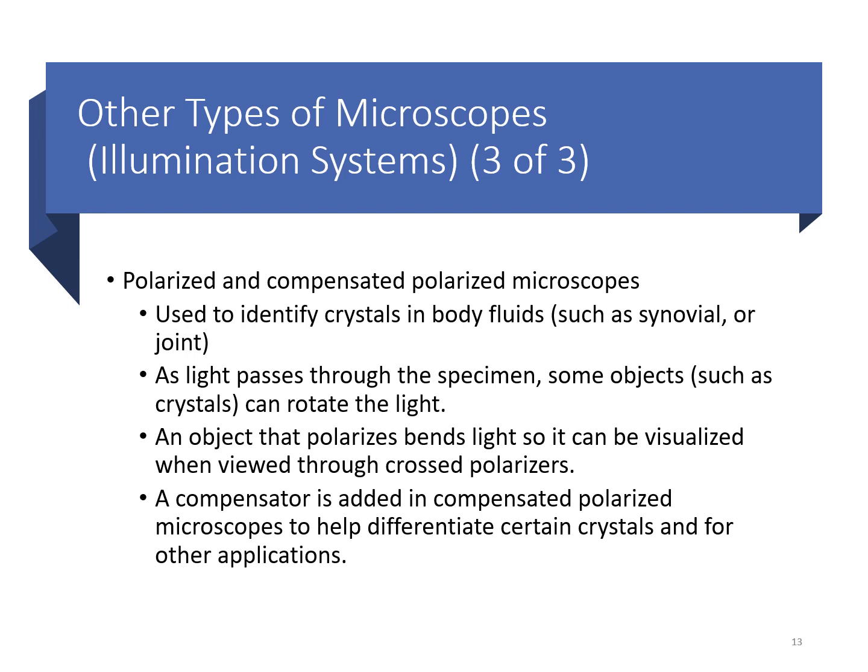We use these when reporting back to the physician, because the crystal type that may be in that fluid will help them determine exactly how they need to treat that patient. The type of crystal that's present in that patient could alter the diet or various other things in the treatment plans. So that's why these particular microscopes are used.